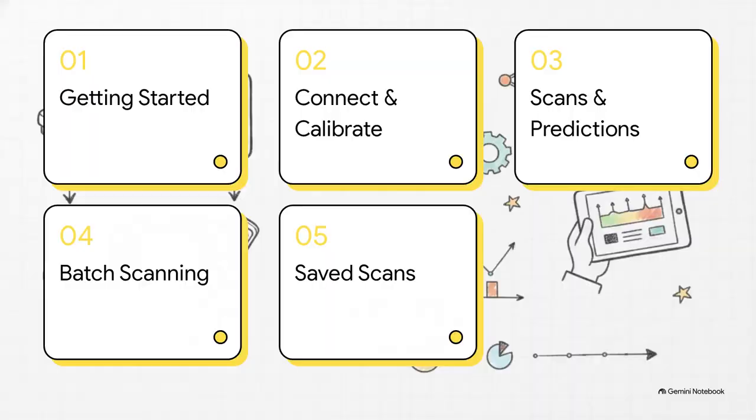Let's get into it. Here's our quick roadmap for today. First, getting started and login. Second, connecting and calibrating. Third, single scans and predictions. Fourth, batch and continuous scanning. And finally, managing your saved scans.